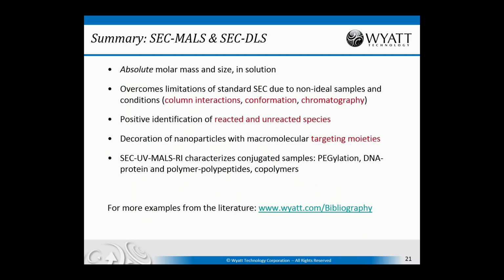This technique overcomes limitations of standard SEC if you have non-ideal samples or non-ideal conditions, if there are non-ideal interactions between the sample and the column, if there are odd conformations that cause your sample to elute differently than the reference molecules, or if something's going wrong with your chromatography.